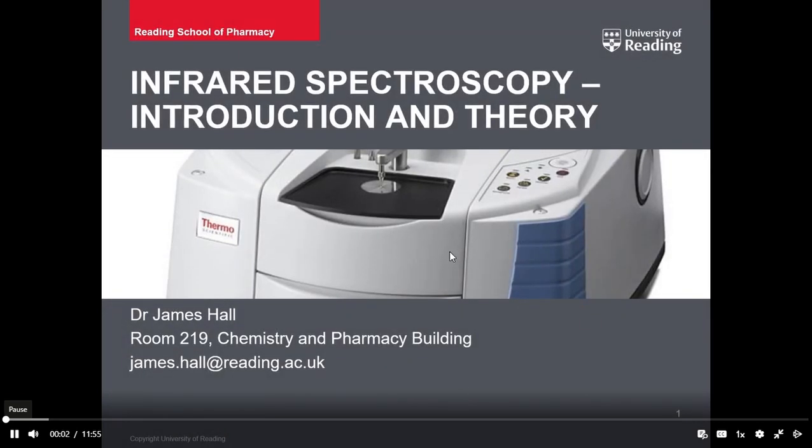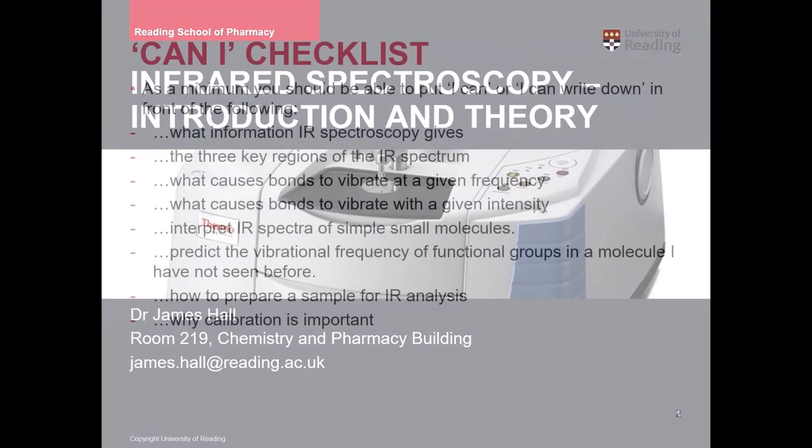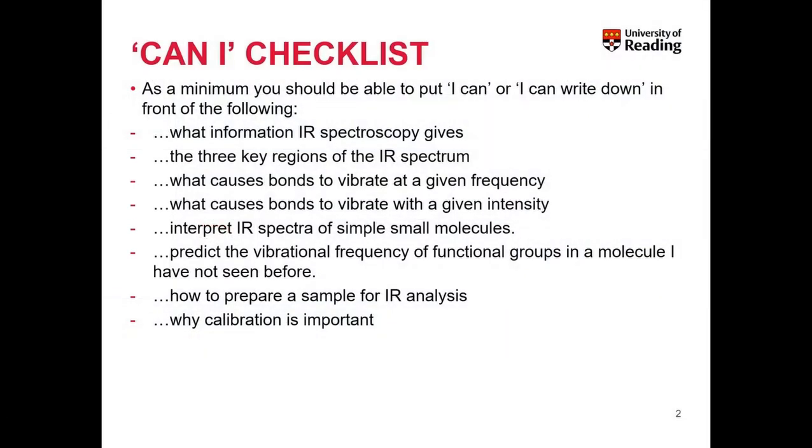In this part of the course, we'll look at a qualitative analytical technique called infrared spectroscopy. Now, by the end of the section on infrared spectroscopy, you should be able to explain all of the following.